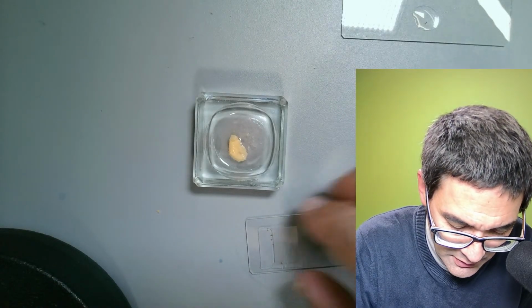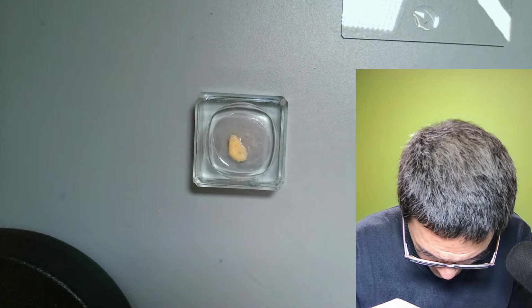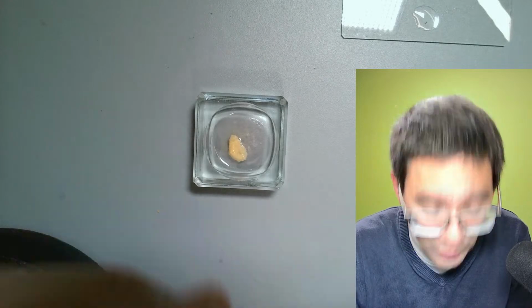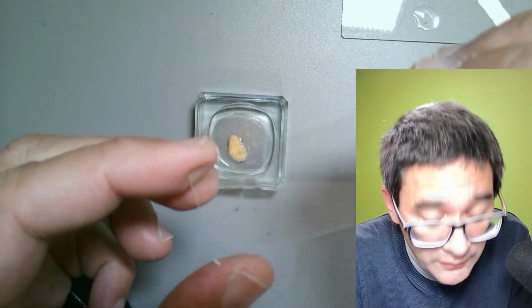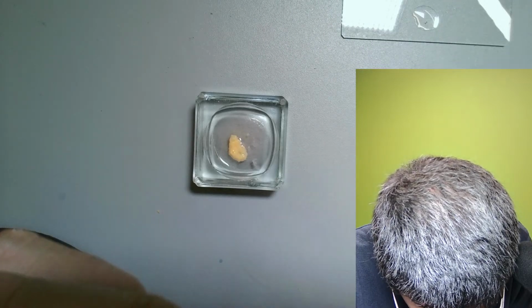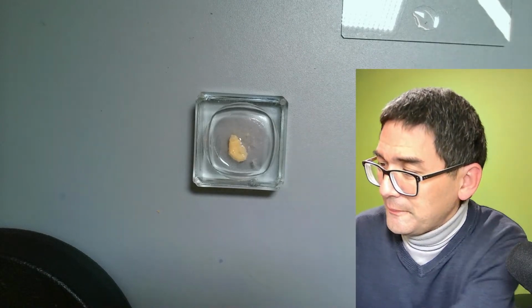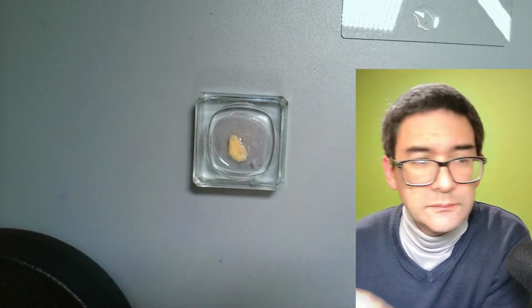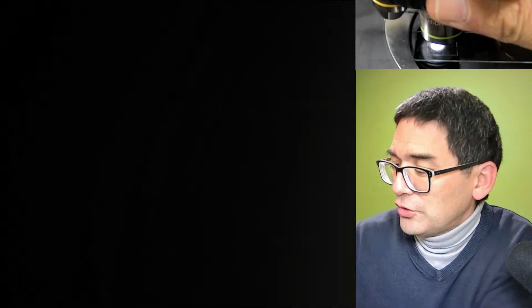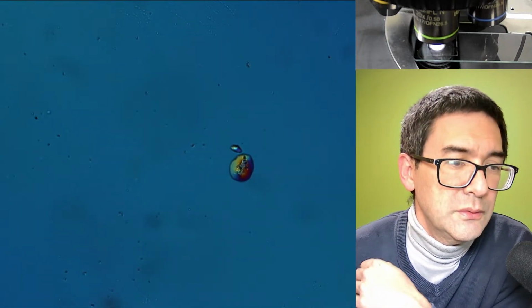So this is number one. Oh, I just see, there is still a lot of solid material in here. Okay, not working because the cover glass is not fully on top. Let me push this on the side here. Now this is better. Okay, that's better now. Let's have a look. And then we can go up really much with the magnification. So let's refocus.